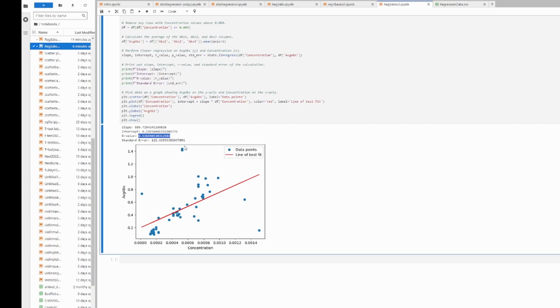So these values right here are out of whack. This is someone did a concentration error or something when they were actually doing their work. And this one here, the absorbance value is too low. It looks like they put in the wrong value. This would be 1, 3, or 5 milliliters of stock concentration. This looks like it should have been here clustered in this one.